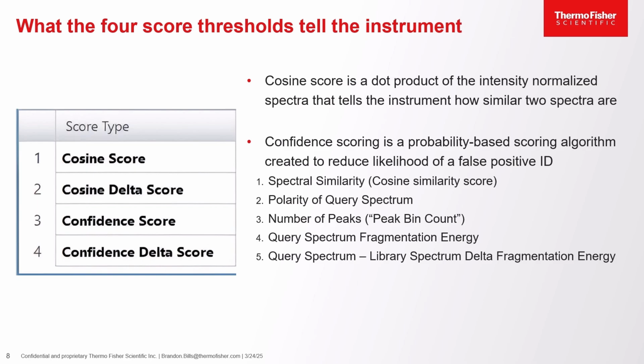So it's a way of saying, okay, I've only got one matching fragment. I'm not all that confident. I want to inform my follow-up scan behavior accordingly.